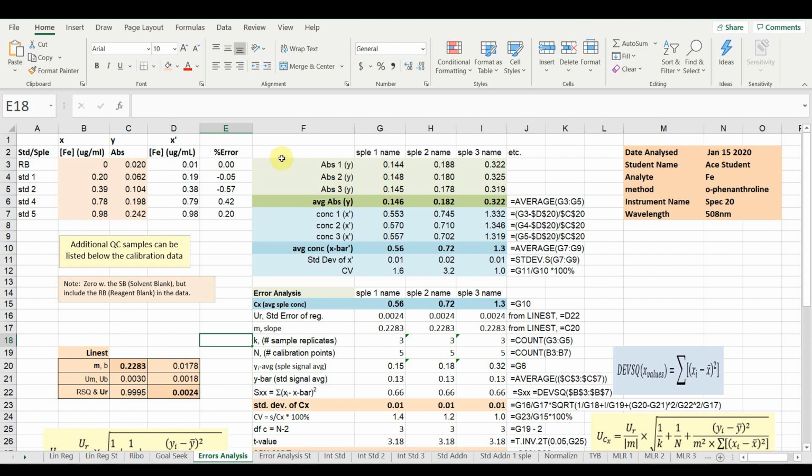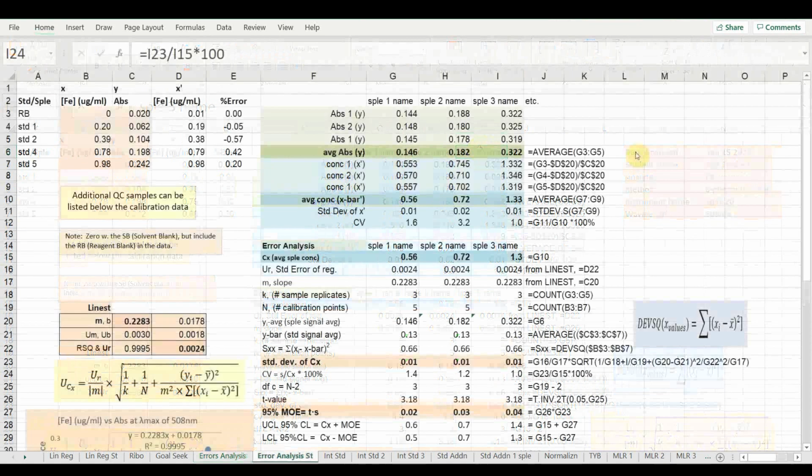The layout shown here works very well for calculating standard uncertainties, and I would encourage you to try this and adopt it. Once the formulas have been built into the first column, they can simply be dragged or automatically propagated into subsequent columns so that each calculation is very simple with minimal changes required. So let's go through this. In this case, she had 3 water samples supplied by the breweries.